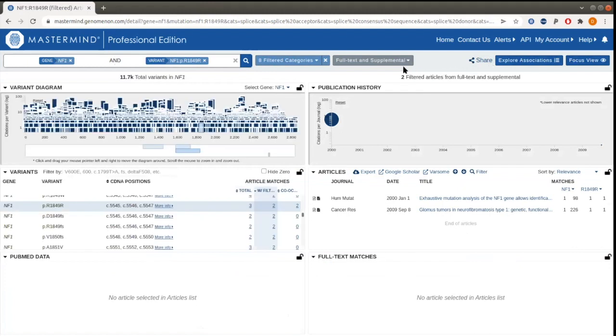As you can see, these filters are engaged with a Boolean OR, so there's probably going to be overlap, even though you select multiple categories.